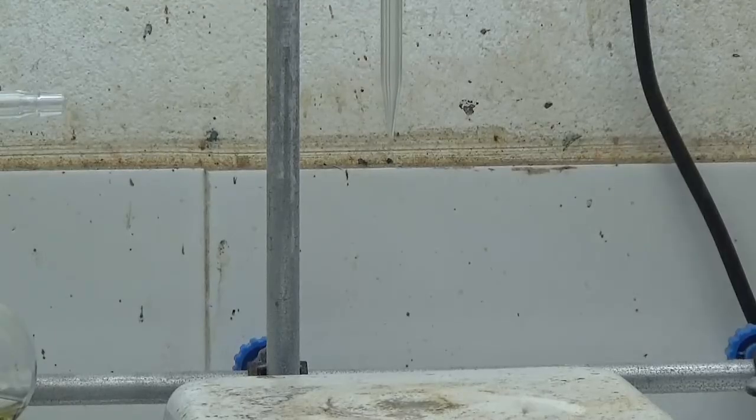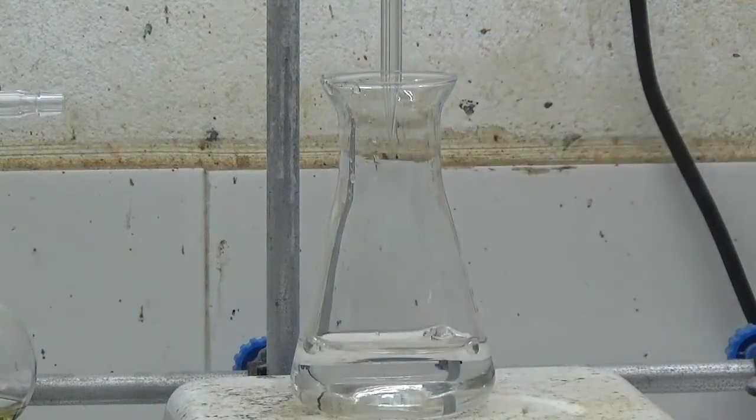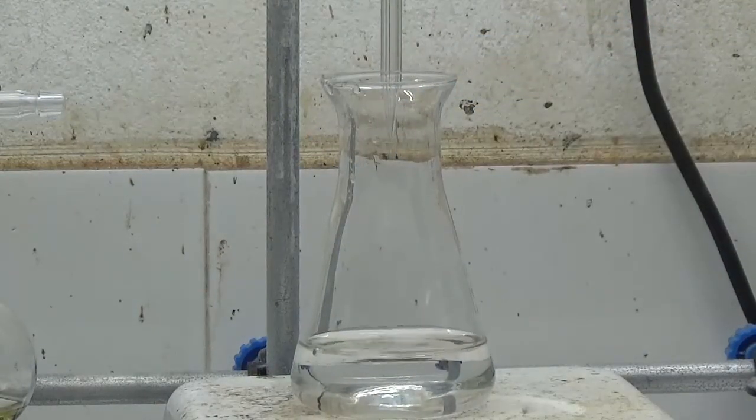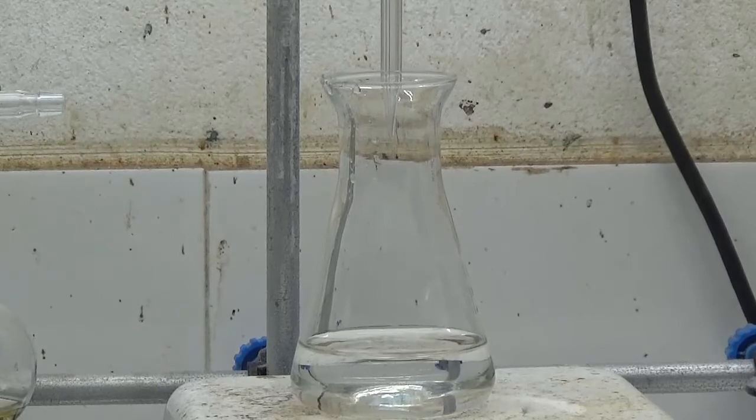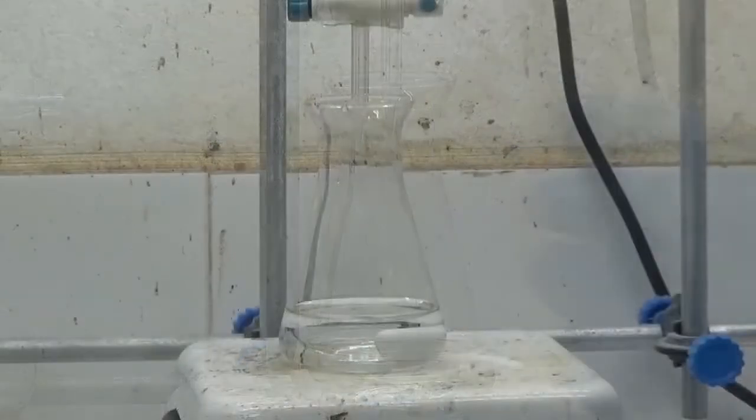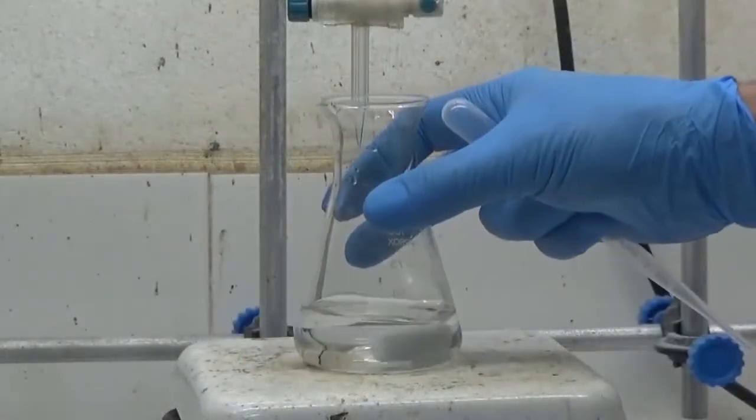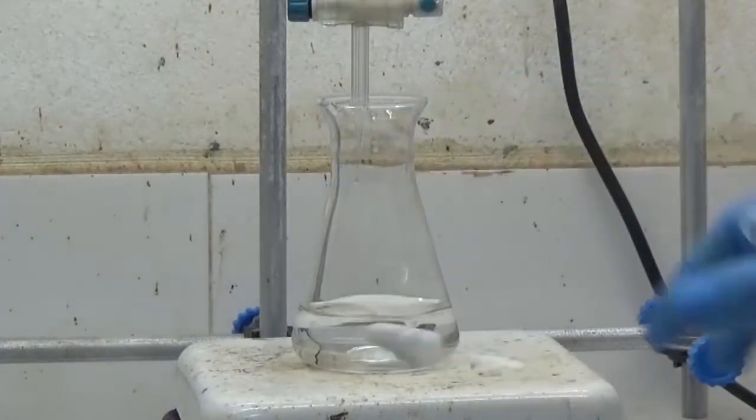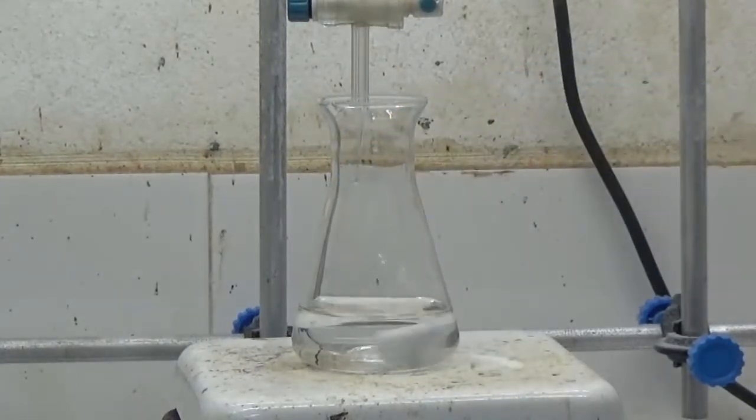A sodium hydroxide solution will be titrated with a 0.01 molar solution of hydrochloric acid. Put 30 ml of sodium hydroxide solution at a concentration of less than 0.01 molar in a 100 ml Erlenmeyer flask and add 4 drops of methyl orange solution.